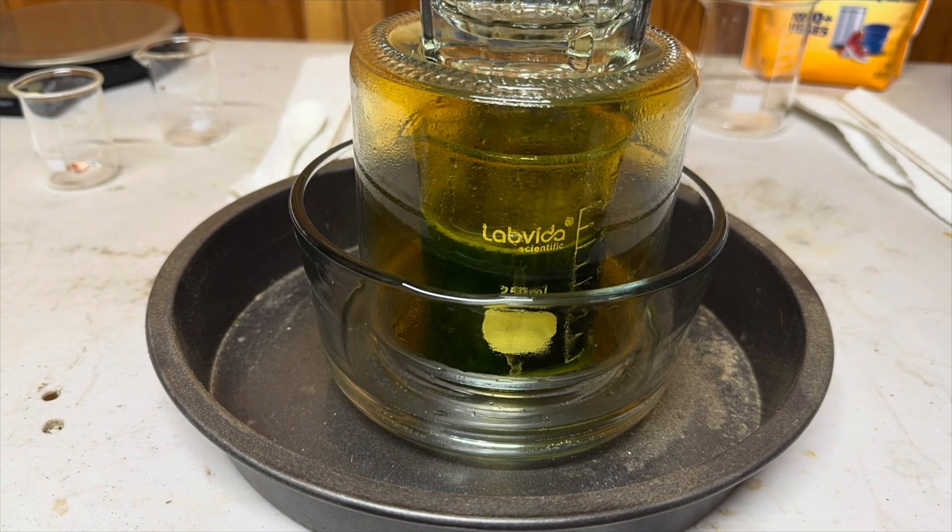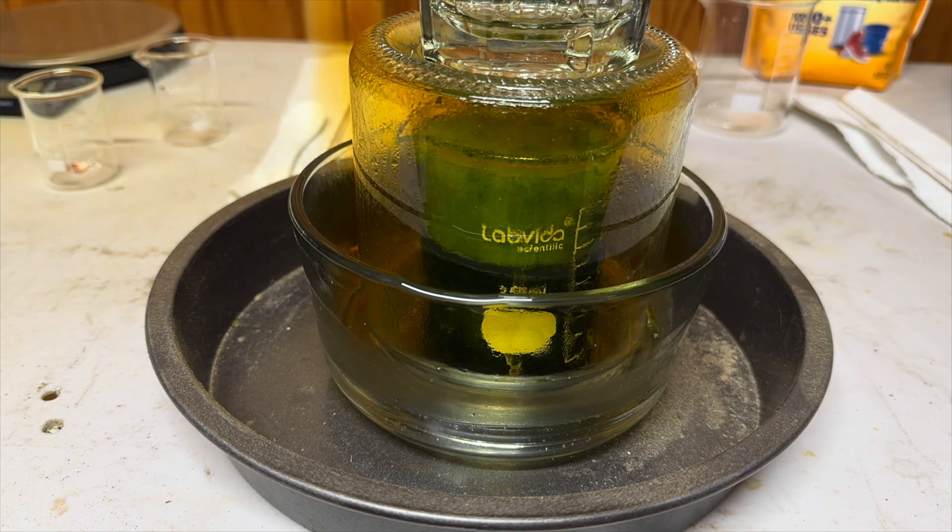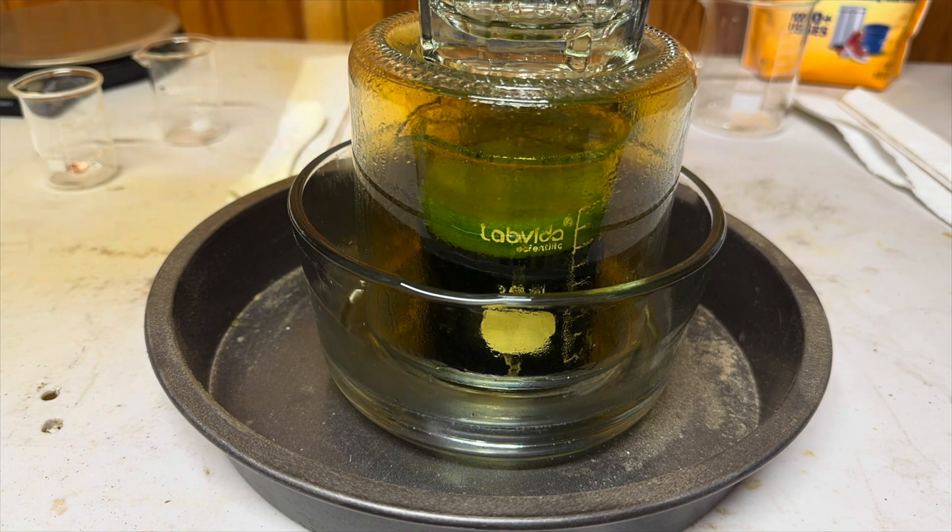As our solution begins to boil and our inner container begins to vibrate, I set a larger glass cup on top of the inner container to keep it from vibrating.